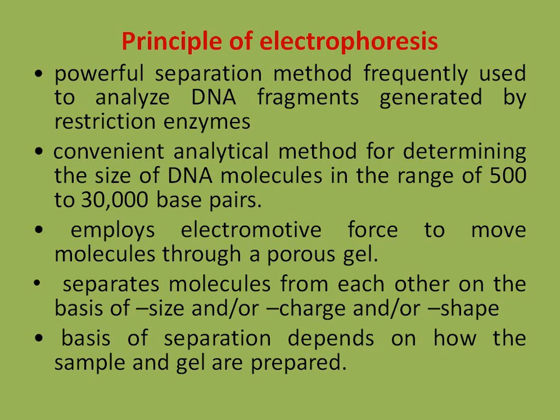It also employs electromotive force to move molecules through a porous gel. So we are using agarose gel, which is porous in nature, and the electromotive force moves these DNA molecules through the pores. It separates molecules from each other on the basis of size.